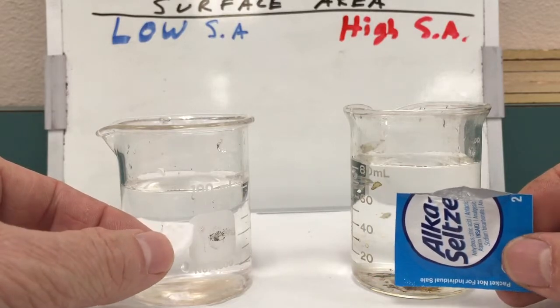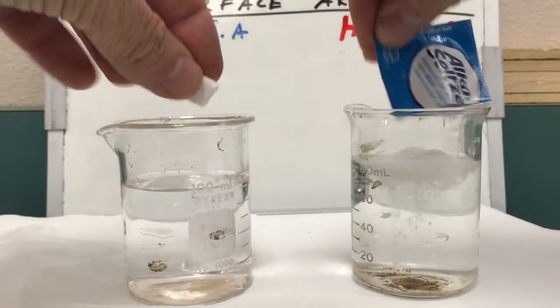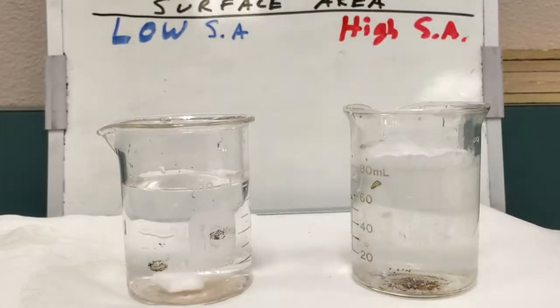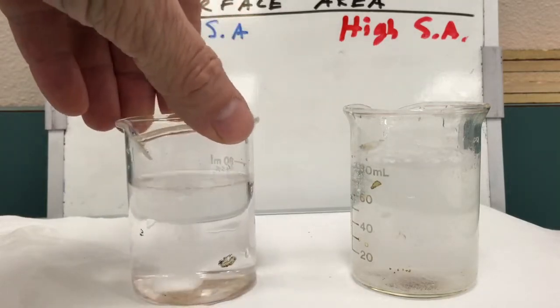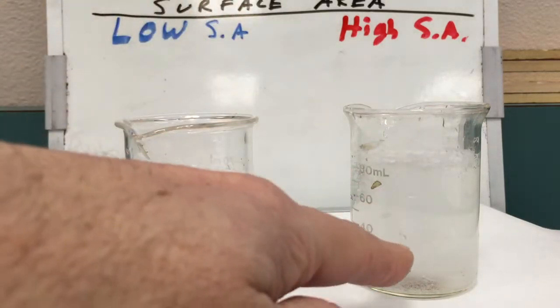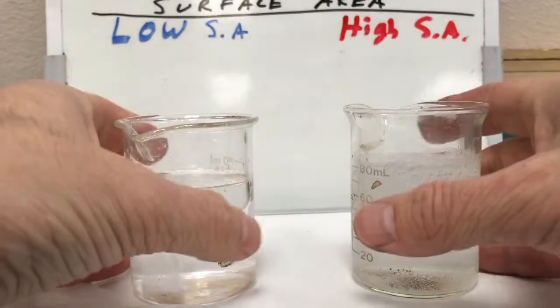So I'm going to go ahead and put those in at the same time, and we can see what happens. This one's already stopped reacting, and this one is still going. So you get the main idea of what we did in the lab.